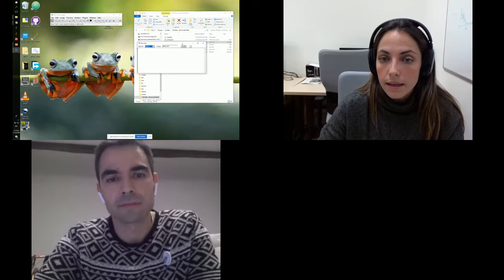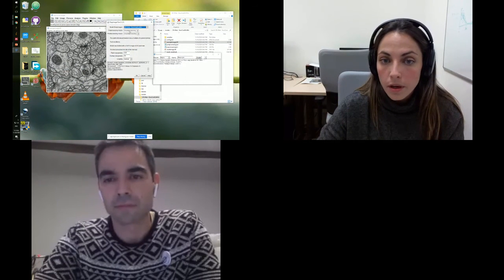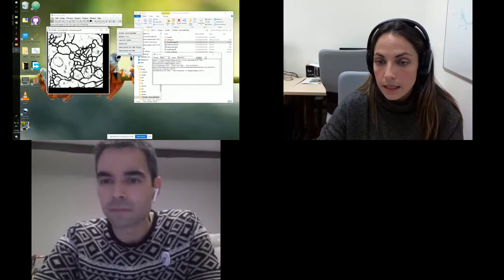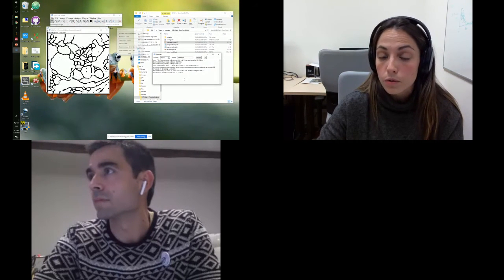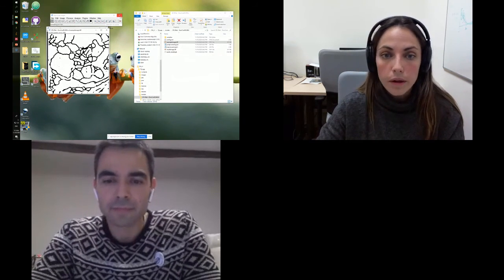So I open the image again. And I can run it, choose my model, pre-processing, post-processing, click OK. And then I just need to copy these lines in a new macro so you can apply DeepImageJ to a batch of images in a folder or integrate it into a more complicated workflow.